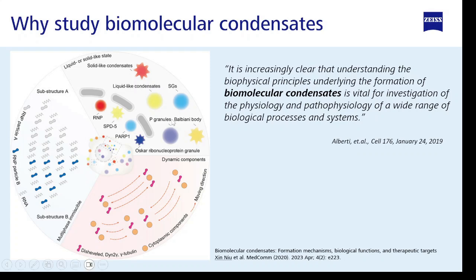So people really want to study the asymmetric molecular behaviors around the border of the condensates.